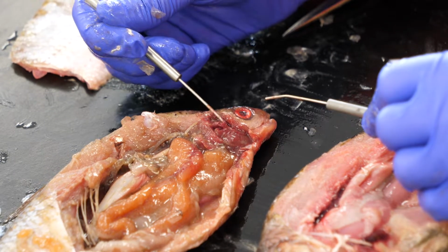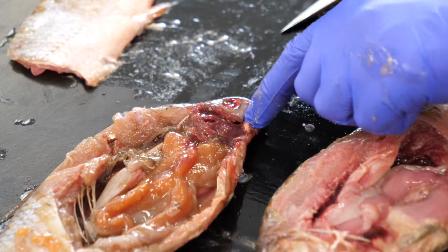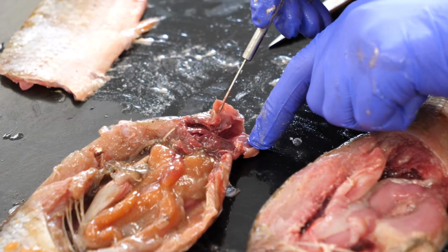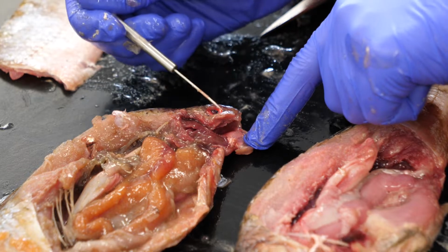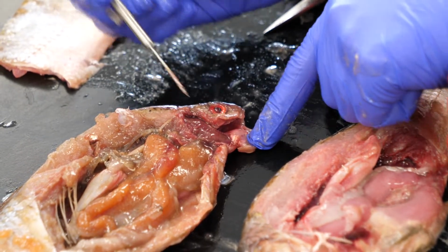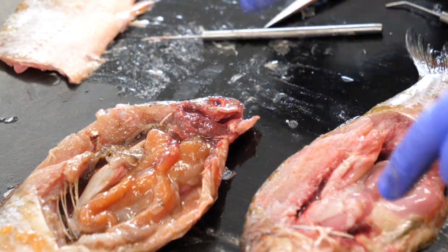So these are the filaments, these stringy bits, and I've cut through the jaw as well, so you can see that the mouth leads directly into the gill chamber, which sits directly behind the gills here. And so oxygen will be exchanged. The gas exchange occurs here, and as I said, we'll have a gas exchange lecture separate to this.